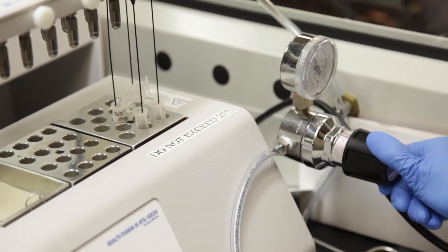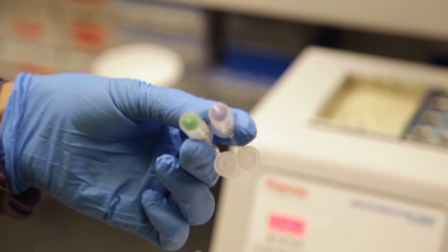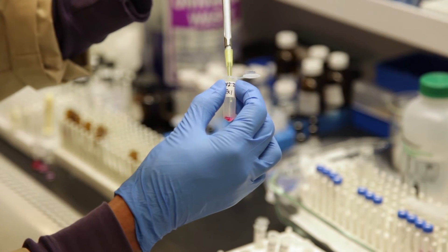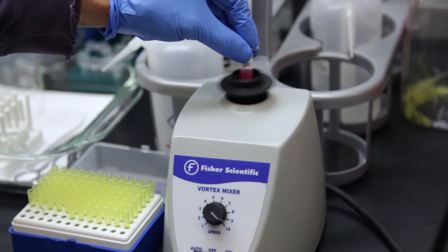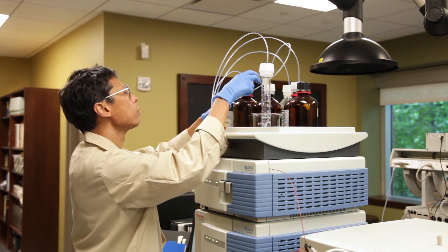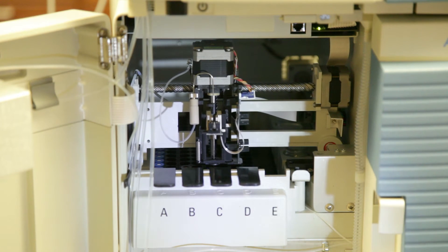We then dry that down to get rid of the acidified solvent and rehydrate it with a solution that's going to be amenable to our analysis. That solution is now introduced into the liquid chromatograph, which separates out each of the individual color compounds. We also simultaneously measure the molecular weight.